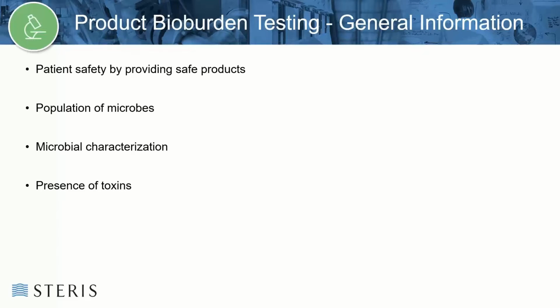From the bioburden test, we can determine the quantity or number of viable native microorganisms present on or in a medical device, a component of that device, or a substrate or chemical. The bioburden population can also be utilized in establishing dose for specific types of sterilization validation. The use of the bioburden data can affect the need or criticality of bioburden method validation.